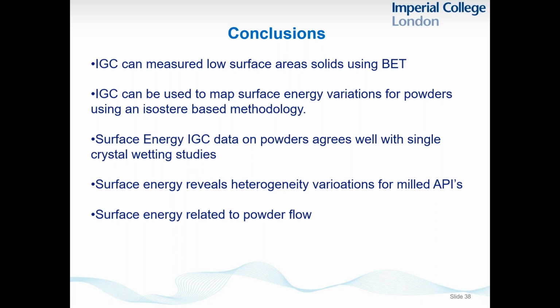So let me start just to give you some conclusions. We've seen today that IGC can measure the surface area of low surface area materials, so materials that are only 1 or 2 meters squared per gram.